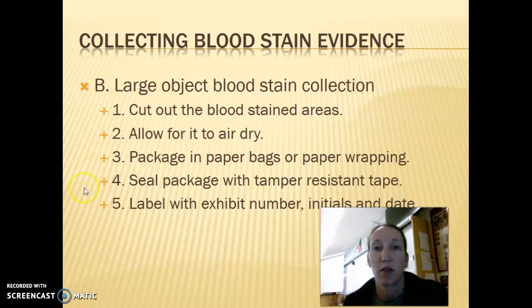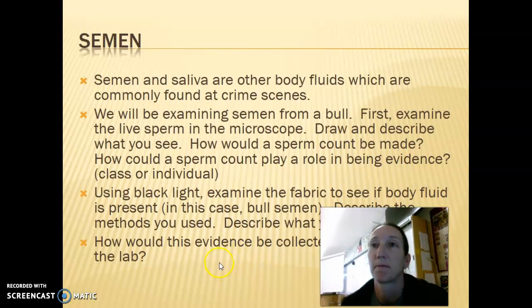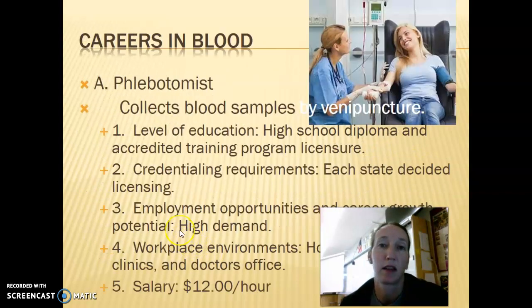And then once again, they'll store it in any type of breathable, porous box, paper bag, paper wrapping, whatever it is. And then, of course, on any of those, you're going to seal it, label it, and put tamper-resistant tape, initial, date. Always, always. All right. And this once again talks about the different parts of bodily fluids detected. We're not going to worry about that.